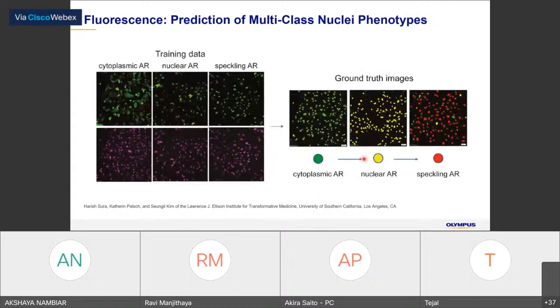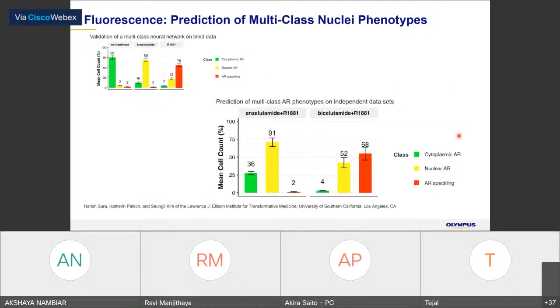Then he can get a very nice result. So this is the training data using the 100% cytoplasmic AR sample, this one is the nuclear AR, and this one is the speckle AR, and we tell it that this one is cytoplasmic, this one is the nuclear AR, and this is the speckle AR.